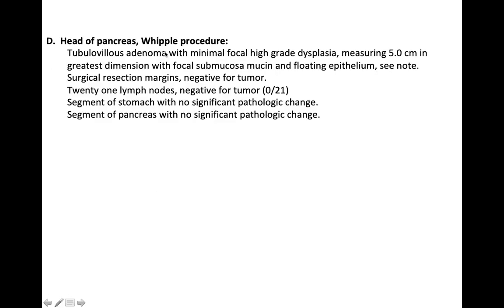This was actually sent for a frozen, and it's really interesting because this was called as margins grossly negative. It's actually a gross only consultation. And again, when it is submitted, you submit it based on having all the margins, and then the representatives, and then you submit some of the lesion. And this was signed out as a tubulovillous adenoma, 5 centimeters in greatest dimension, and resection margins were negative, and the lymph nodes were negative.